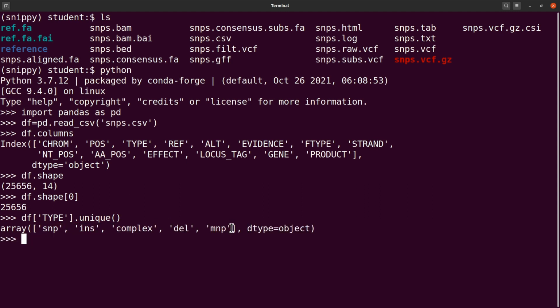It's very simple. Instead of just going to click and drag and all that, just one line of code will just do magic for you.